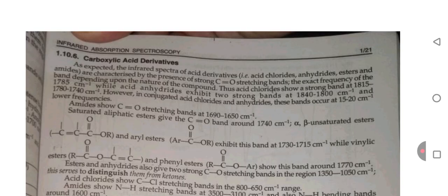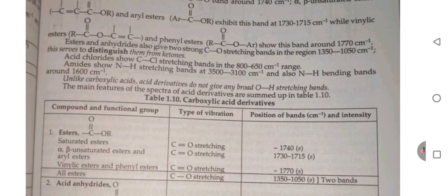Ester and anhydride also give two strong carbon oxygen stretching bands in the region 1350 to 1050 cm inverse. This serves to distinguish them from ketones. Acid chloride shows a carbon chlorine stretching band in the 800 to 650 cm inverse range. Amide shows an NH stretching band at 3500 to 3100 cm inverse and also an NH bending band around 1600 cm inverse. Unlike carboxylic acid, acid derivatives do not give any broad OH stretching band.